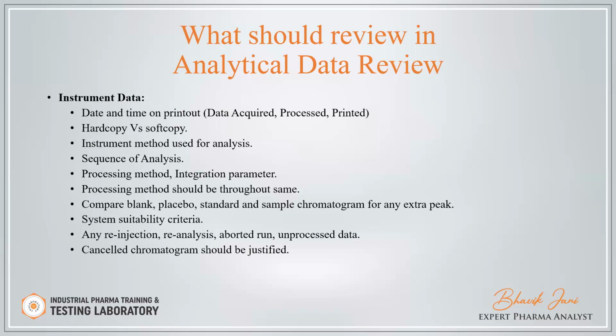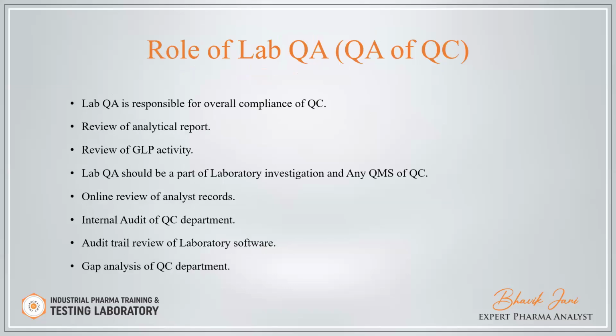Compare blank, placebo, standard and sample chromatogram for any extra peak. System suitability criteria, any reinjection, reanalysis or aborted run and cancellation chromatogram should be justified. These should all be reviewed during your chromatographic data review or any electronic data review.